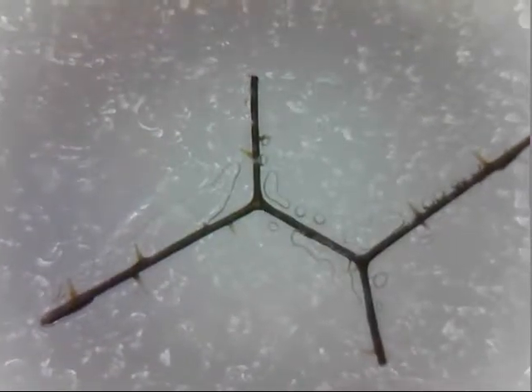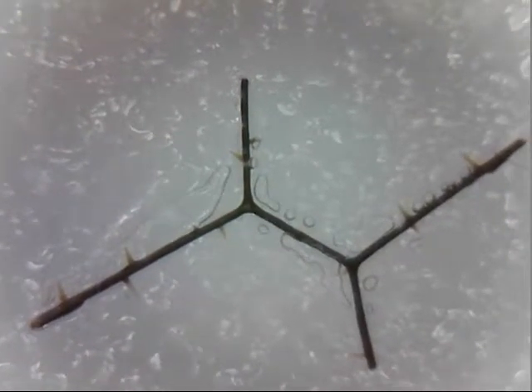So there's a chunk broken off, isn't there? Okay. We've got this, which has that yellow chunk that's very large. I don't know what's going on here. Separate two. This is what I first saw. This is what made me think, oh, a stick. It's not a stick. It's too tiny to be a stick. So this is a dragonfly wing, but not what I expected.